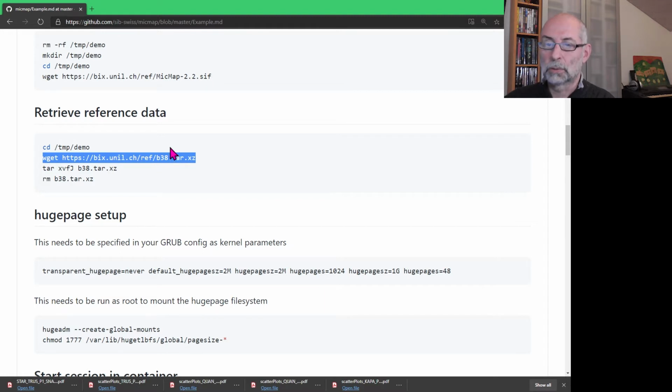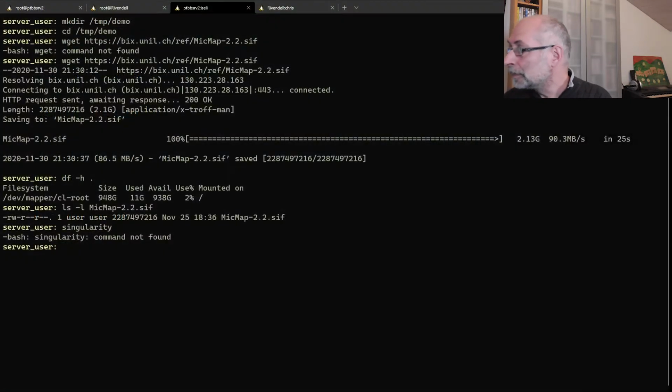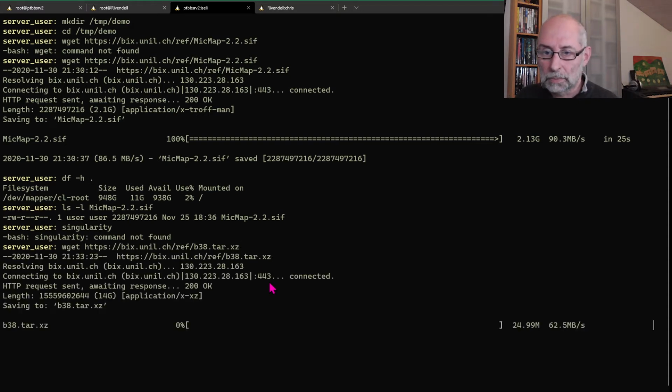So let's copy this and go back here, switching, pasting the command here, so that will take a little while.